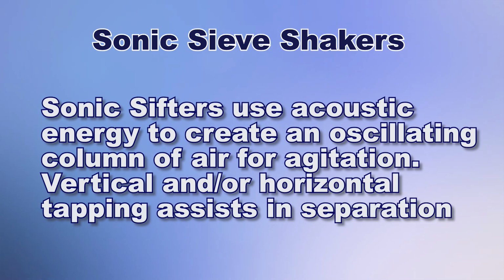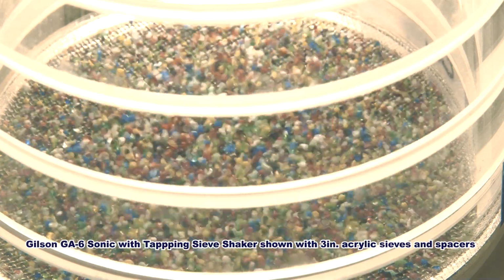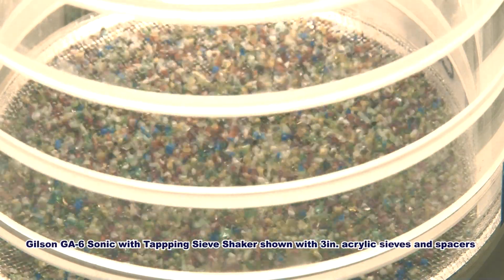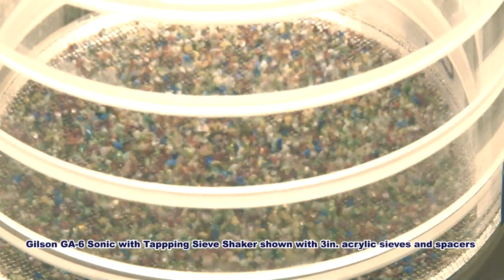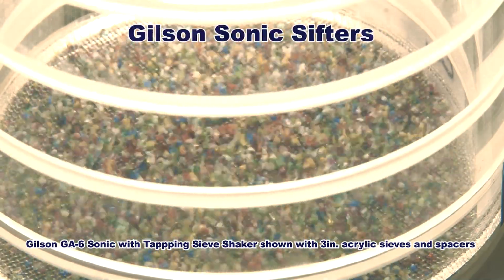Sonic sieve shakers, sometimes called sonic sifters, use acoustic energy to create an oscillating column of air for agitation, and vertical and/or horizontal tapping assists in separation. Rapid pulses airlift each particle off the sieve cloth, causing it to reorient and land on a different opening to assist in particle separations.